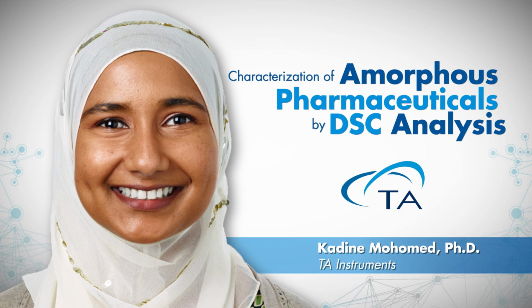If you have a liquid sample, or even a wax-like material, and you know that it is a semi-liquid at room temperature, then as you place it in a DSC, you want to use a controlled cooling rate experiment so that you know what that crystallization event and its kinetics are, that you know it's controlled at the cooling rate you've set.